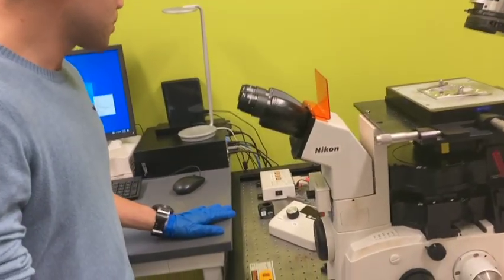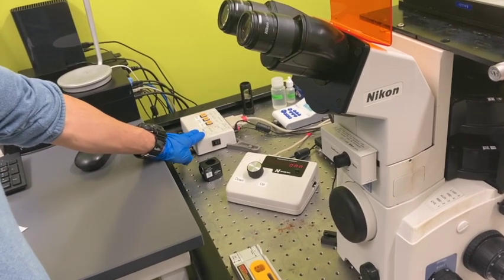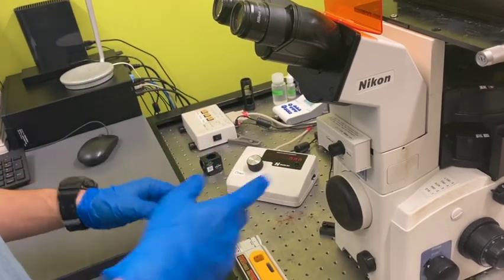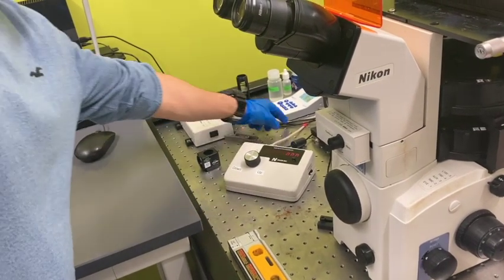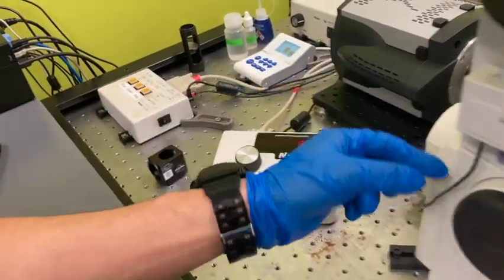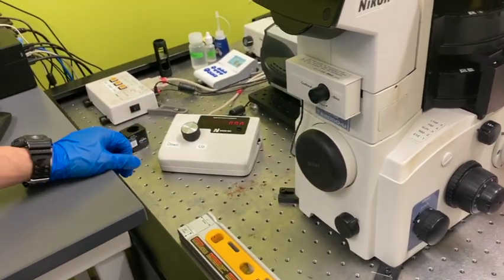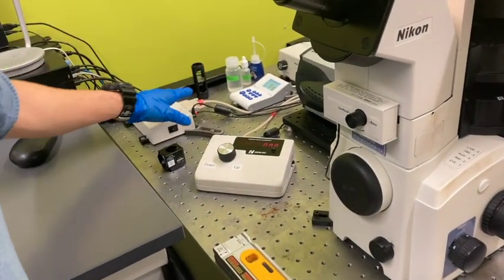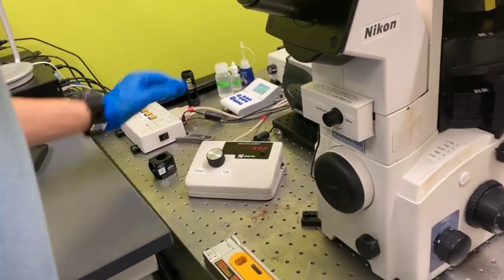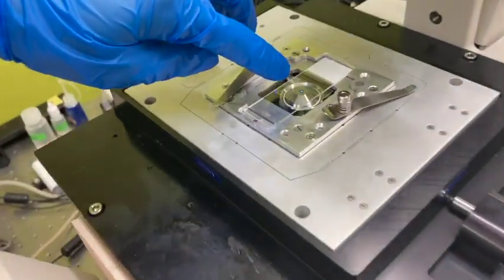Okay, so coming back to the illumination, for the laser control, there is a safety protection feature for this microscope. If you see, there is a cable coming out of this controller, and it connects the microscope to this. And if I turn this on, so now our laser is on. If I have blue, let's see. Yeah, right now you can see the blue laser is coming through here.